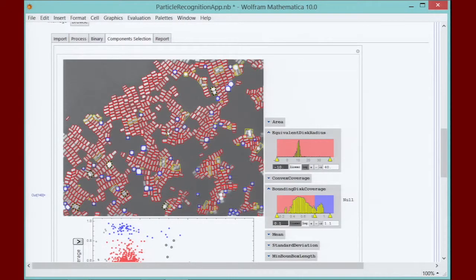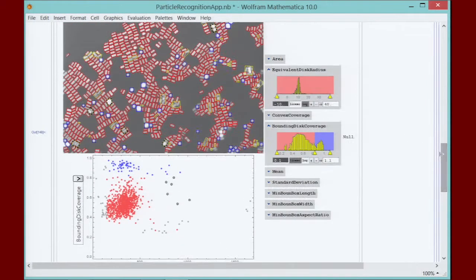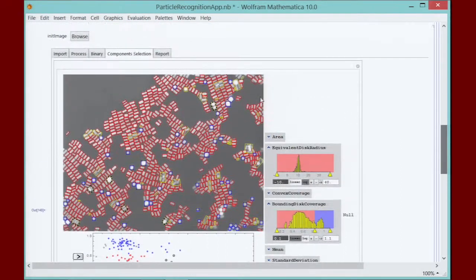So in the end, this really speeds up the finding of the right conditions for the exact parameters of your measurements of the exact colloidal sample, which of course differs on both the method of the preparation of the sample for the microscope and then the methods for the analysis. Then you can move.